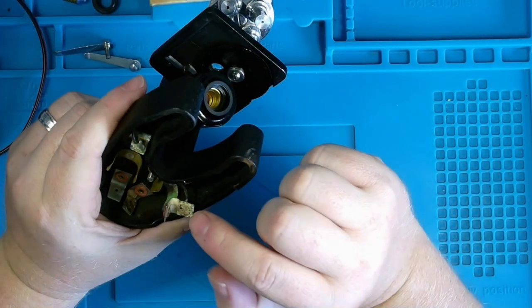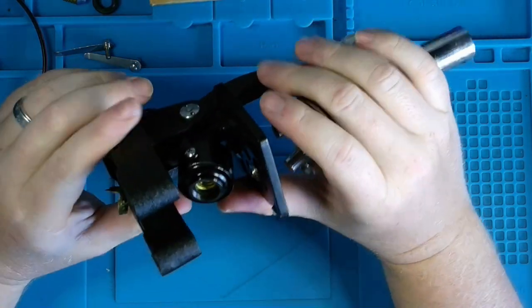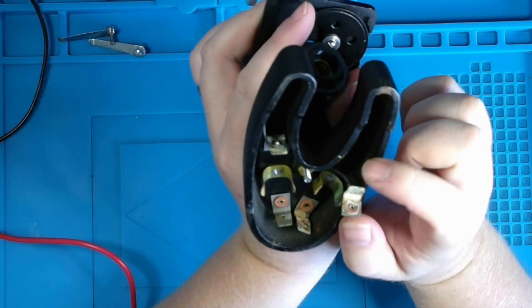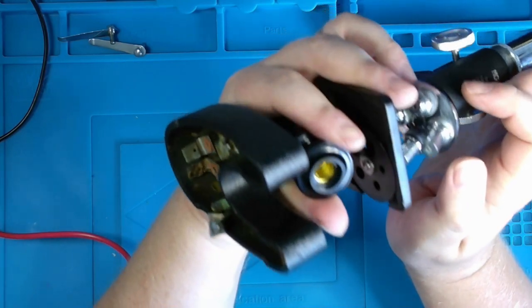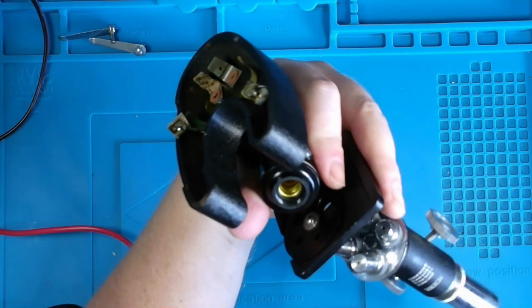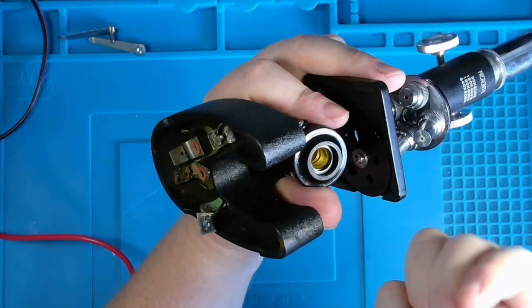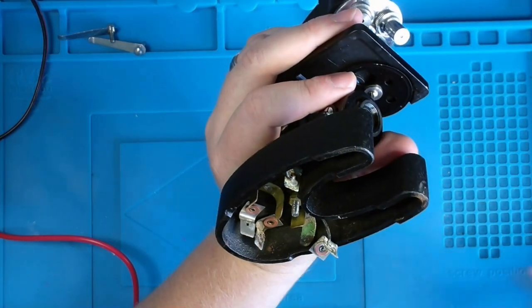I guess I'll be toning out these wires in here to see if we've got good continuity. Well, just testing for continuity. It appears that we still have continuity on our positive rail here. But the negative rail seems to be the major problem. Positive rail actually goes to the screw portion of the bulb. Negative rail goes to the center pin, I would believe. But at least I know where the positive rail continuity goes to.